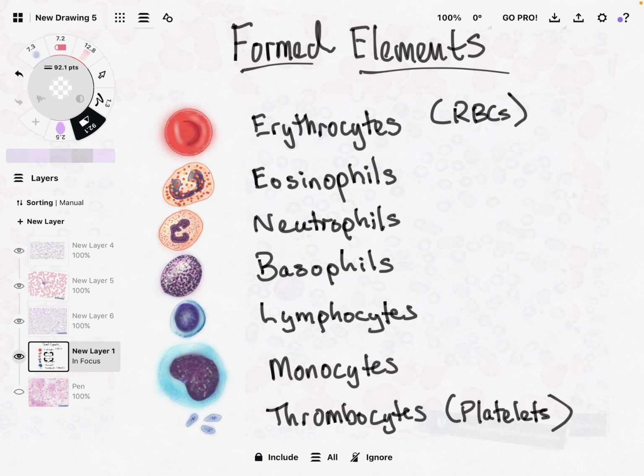The other thing I want to point out here when we actually start to look at the slide images is that what you typically use when you do something like a blood smear is H&E stain. And you've probably seen this term, especially if you've already done a lab about this, and you see on the side of that slide, it says something like blood smear, H&E stain, and maybe it has a date when it was actually made. The H&E stands for hematoxylin and eosin. And hematoxylin and eosin is a very common stain that is used in a variety of processes. It's a very good general stain.